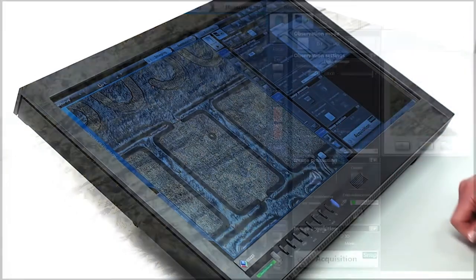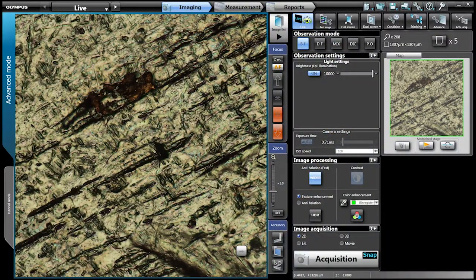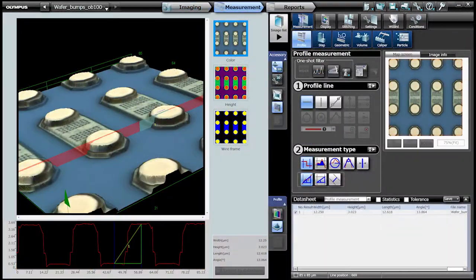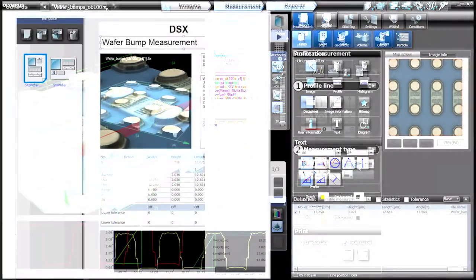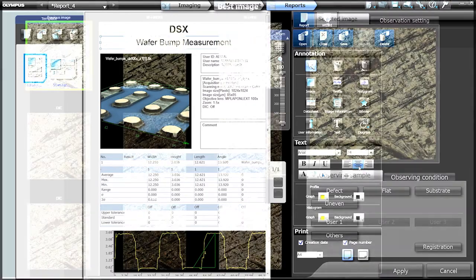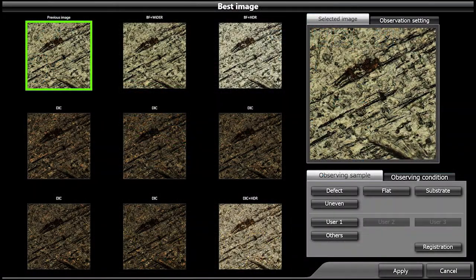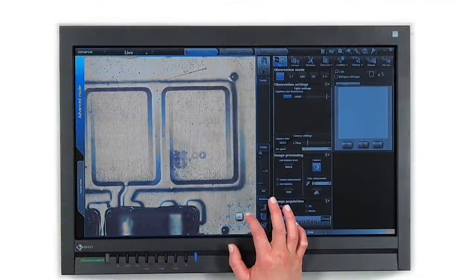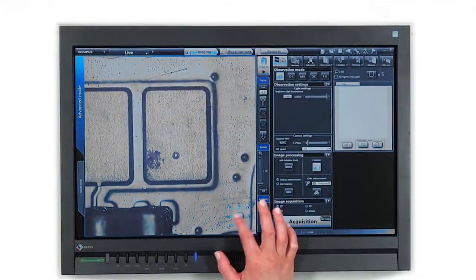You capture images, acquire measurements, perform high-level analysis, and get reproducible results all with just a touch of the screen.